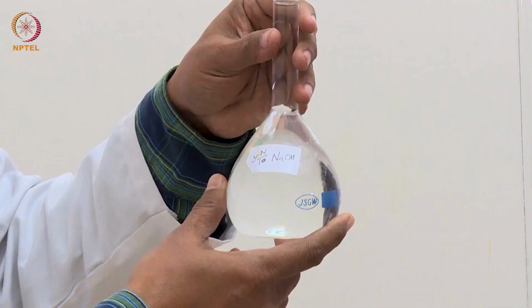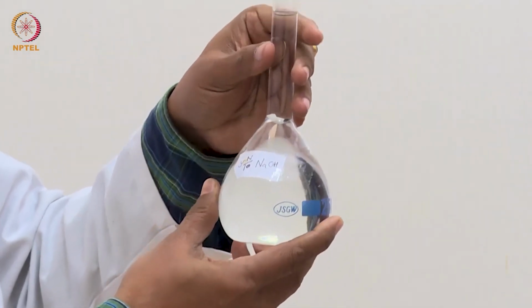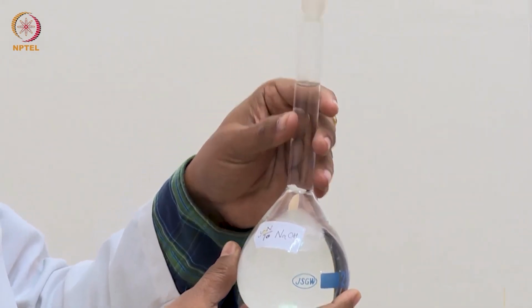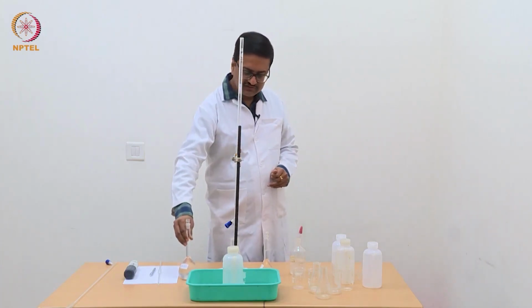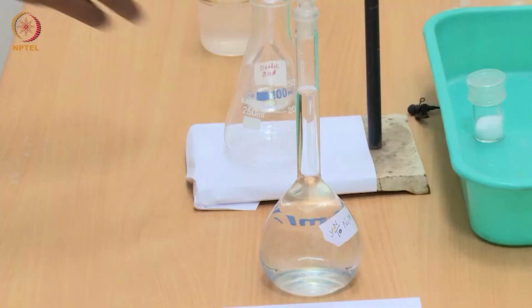So, after this we will use this NaOH in the future experiments of potentiometric titrations for the strong acid HCl, the weak acid acetic acid, and the dibasic acid oxalic acid. So, at the beginning we need to standardize this NaOH for our next set of experiments.